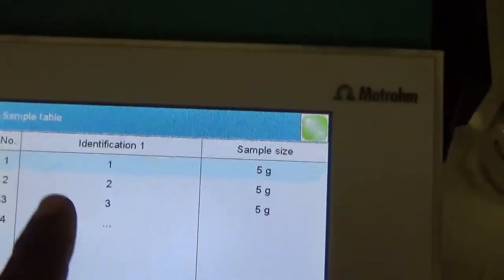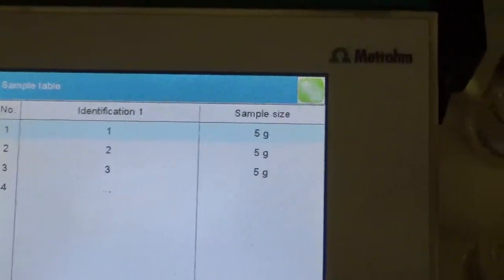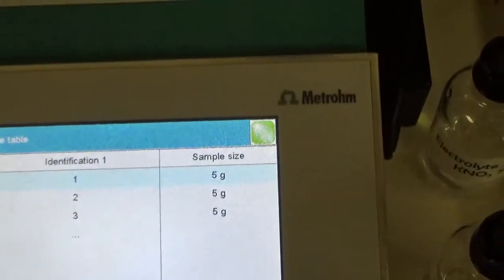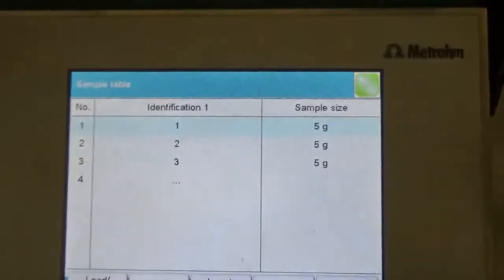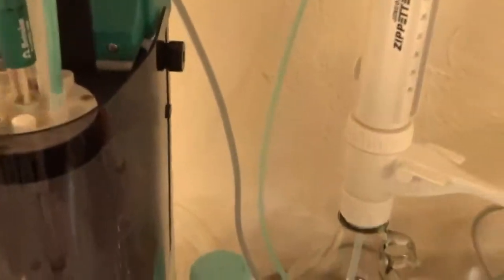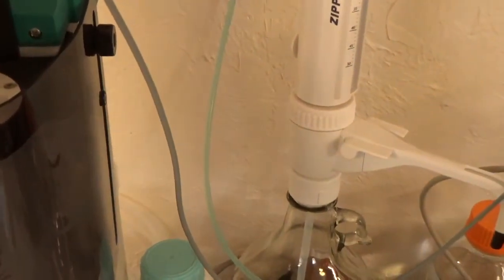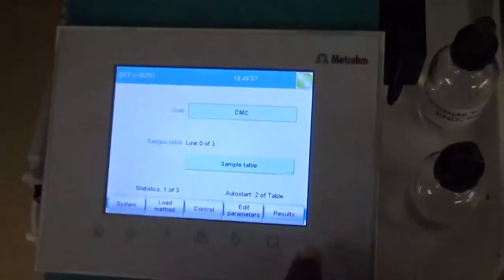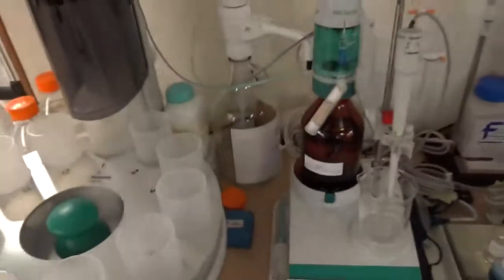Once all the data is inserted for each sample, with the electrode and buret inside, we just press the start button. As soon as we press start, the titration begins — the rack moves to position 1, the tower goes down from home position to work position, the burette fills the cylinder with silver nitrate, and incremental dosing begins.